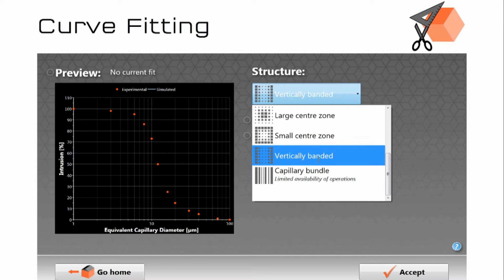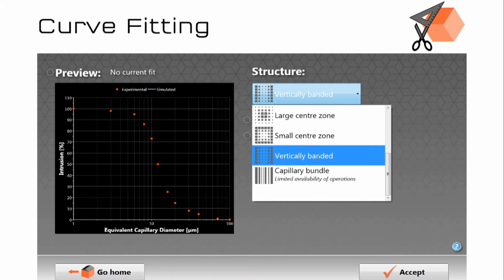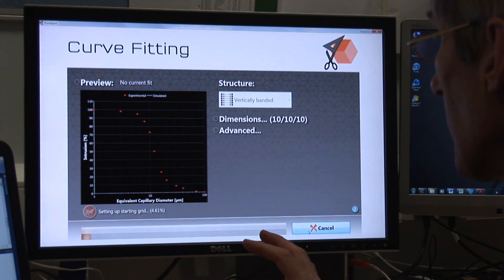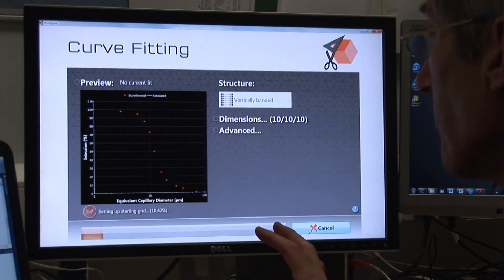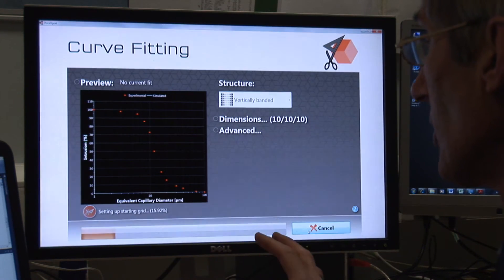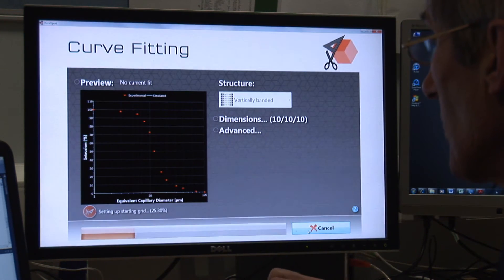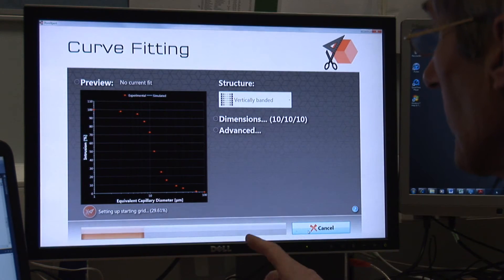Natural samples vertically banded is quite often a useful structure to use. So we then say that we would like to accept that and get the simulation to converge onto the experimental data.